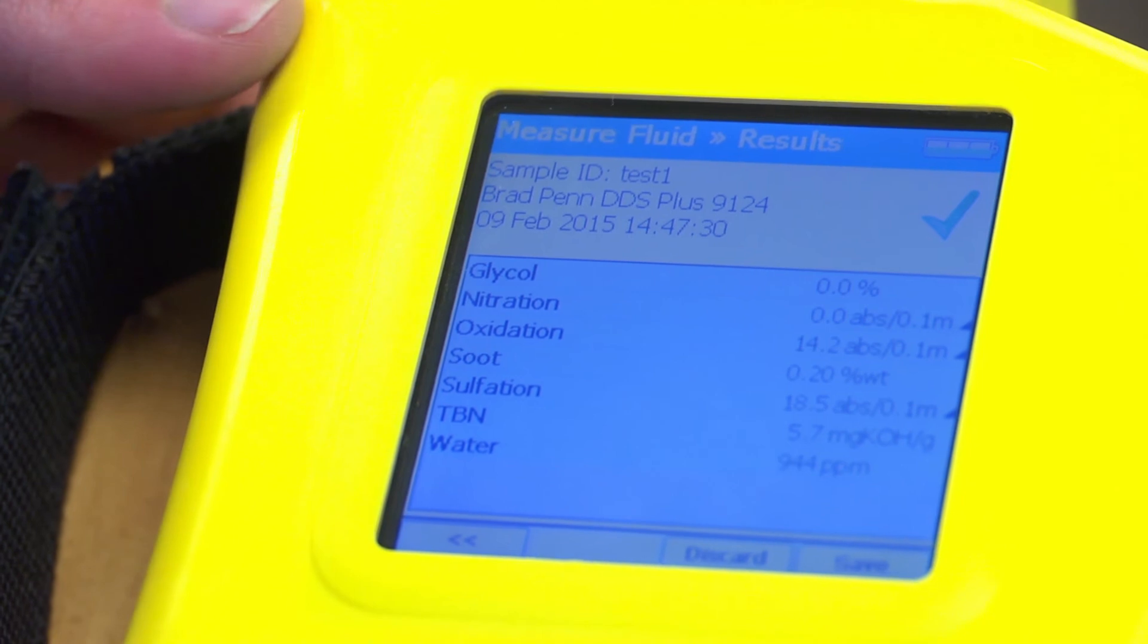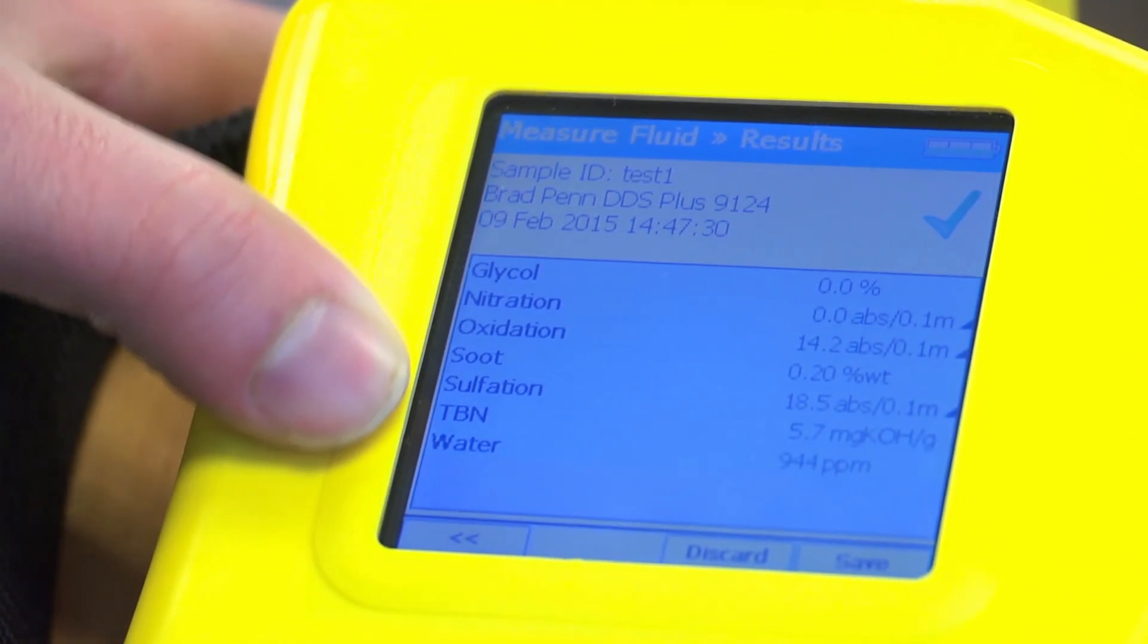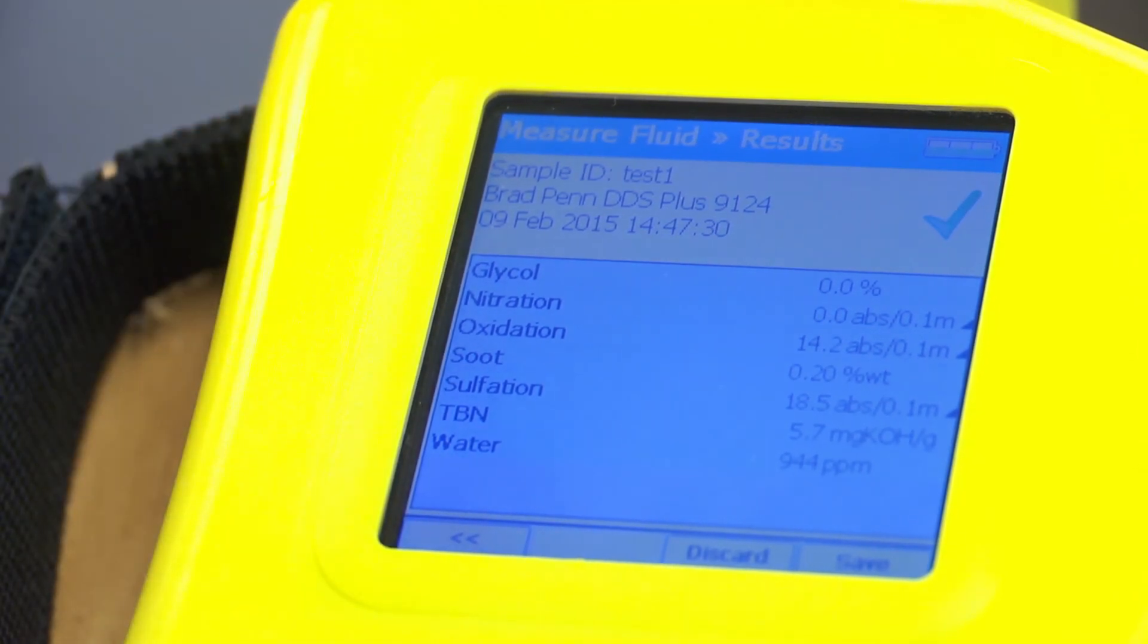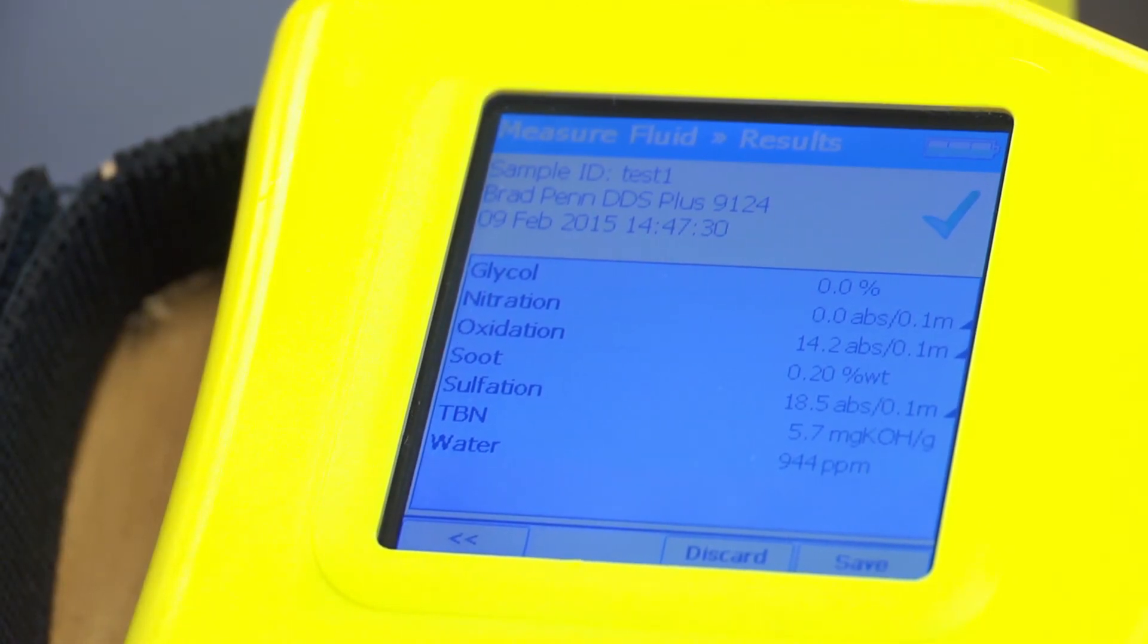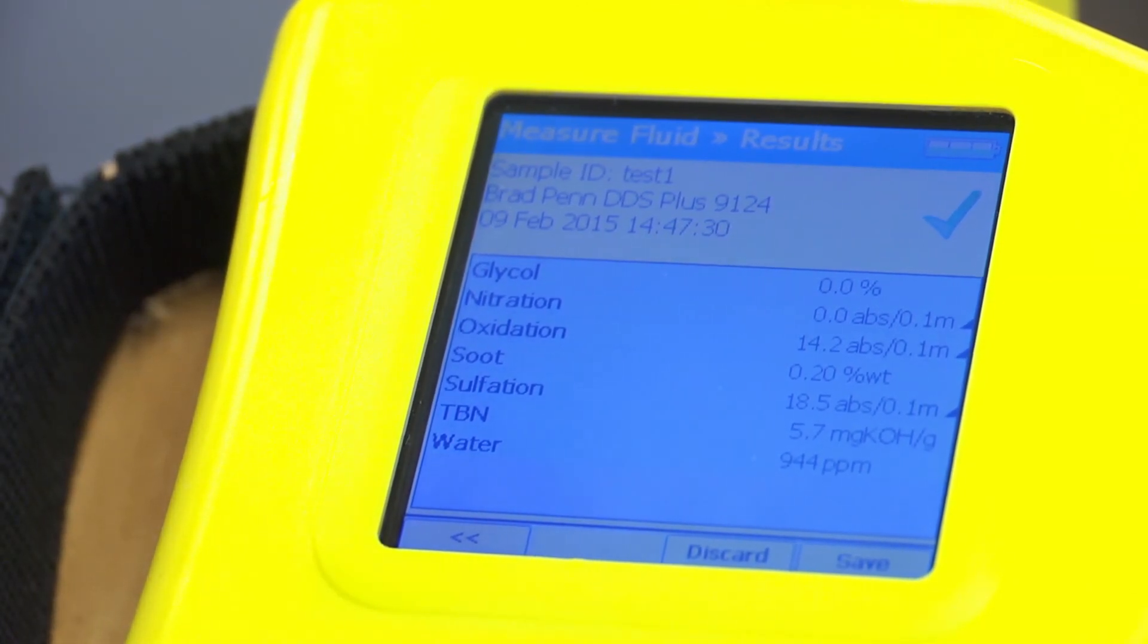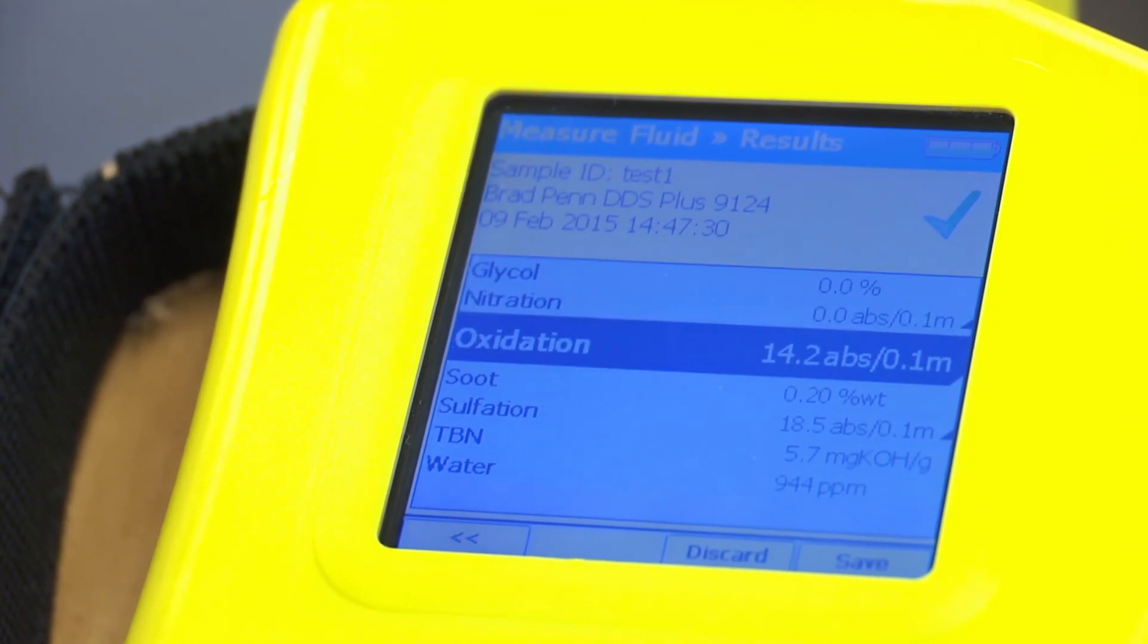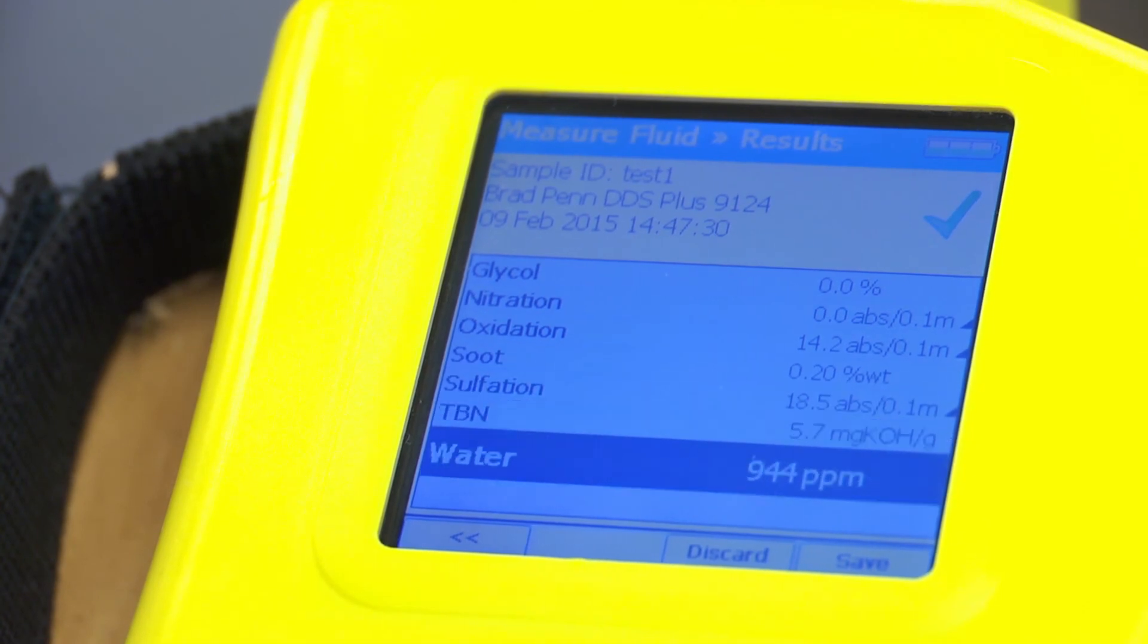Now once the results come up, you will see that there is a parameter listed for each oil. These parameters are preselected based on the category the oil belongs to. For example, for an engine oil, typically standard industrial parameters include glycol, nitration, oxidation, soot, sulfation, TBN, and water.